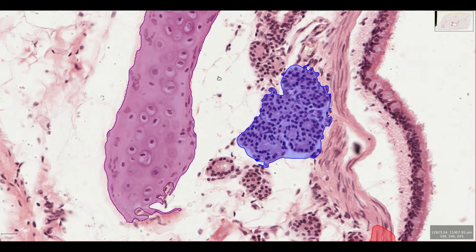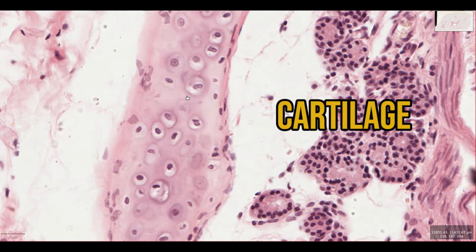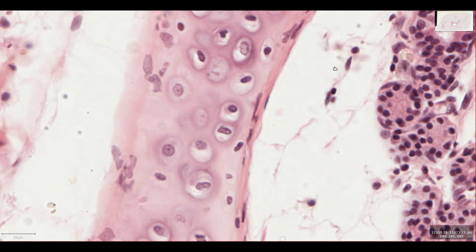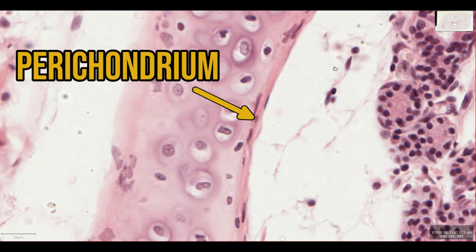Finally there are islands of cartilage to give mechanical support to the bronchus. You can see chondrocytes within lacunae and cartilaginous matrix surrounding them. Each island of cartilage has a thin coating layer of connective tissue with some fibrocyte-like cells. This is the perichondrium, and these cells are able to develop into chondroblasts that replace the mature chondrocytes when they die.